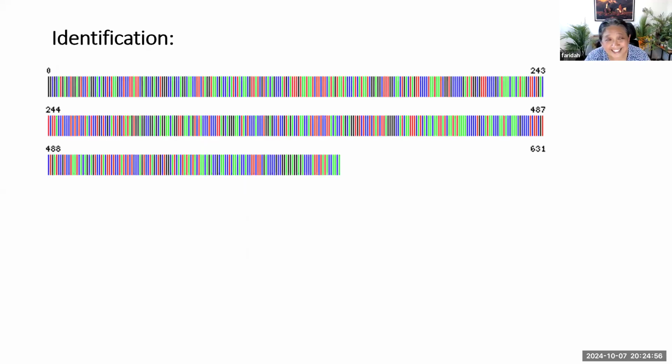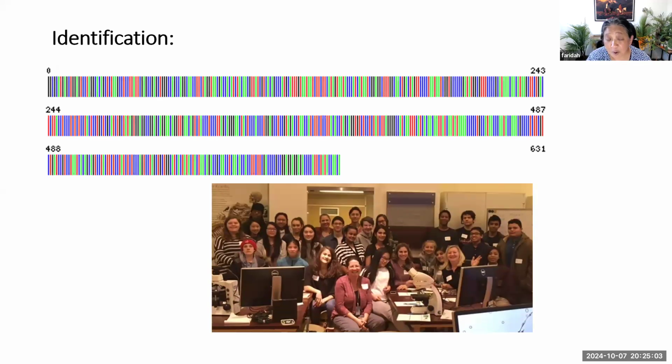Okay, better. So this is a nice looking barcode. And then what happened is it came out Homo sapien. And the bag has feathers, and it was not a fatal case, so there must be contamination somewhere. Sometimes it's as easy as the folks just forgot that they had chicken for lunch. They didn't clean their hands, and they wiped it with whatever they wipe it with, and put it in the bag.